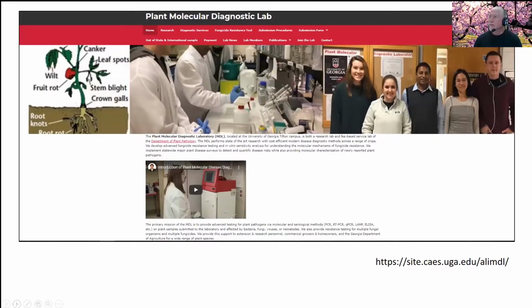More recently, the Plant Molecular Diagnostics Lab down in Tifton, Georgia, has taken over this process from Clemson, and Md Ali is the leader of that group. This lab is now capable of running the same basic analyses on botrytis, and I'll also talk to you about anthracnose and what they're doing for that as well. You can send samples there from throughout the Southeast, and these samples will be analyzed.